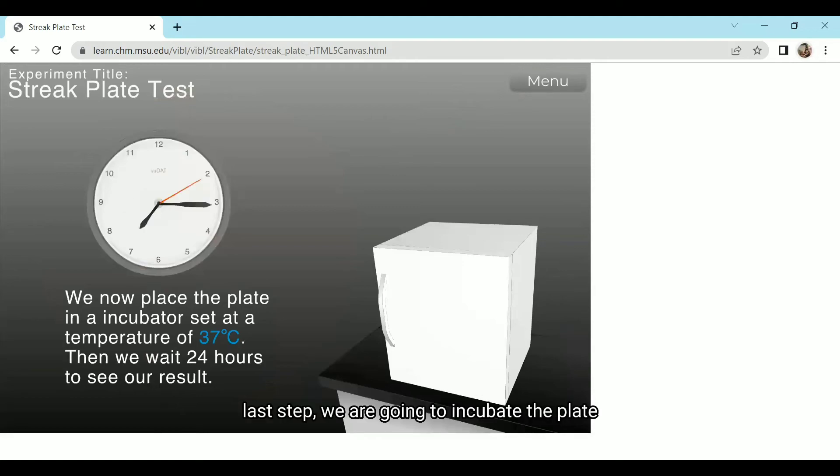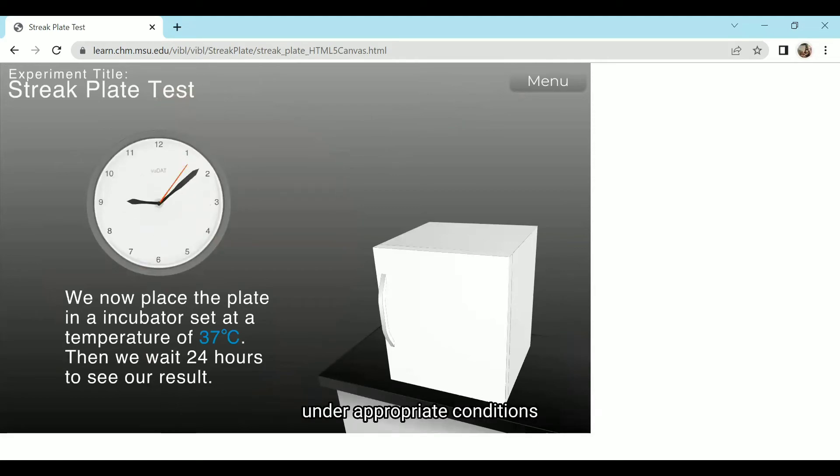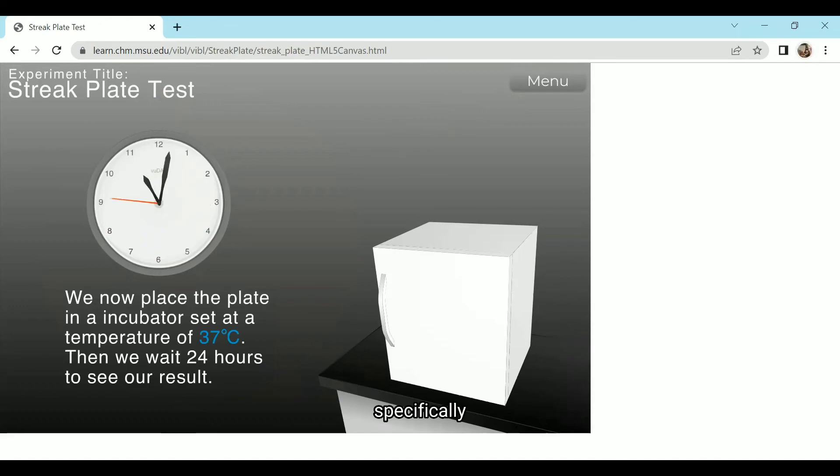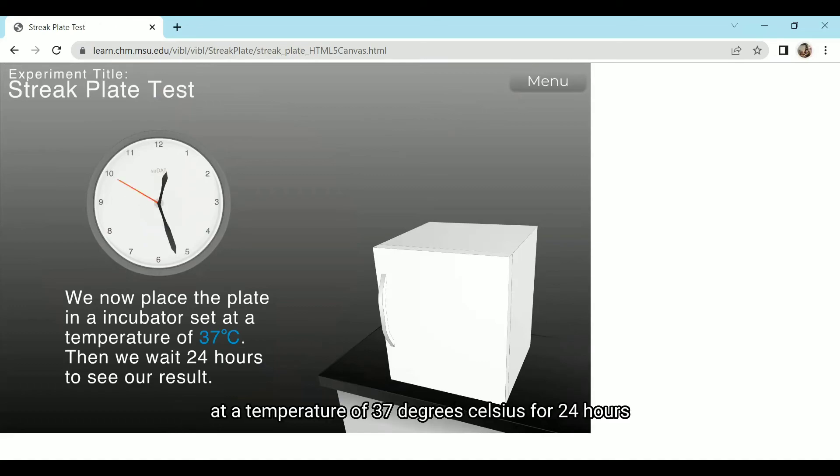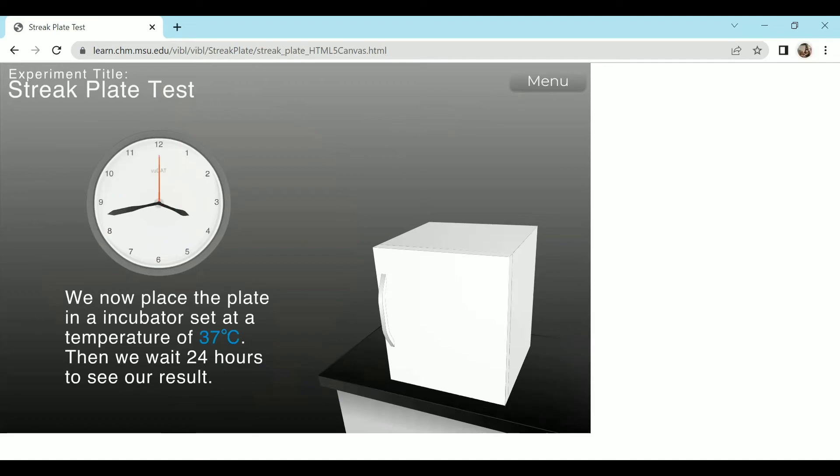Last step, we are going to incubate the plate under appropriate conditions, specifically at a temperature of 37 degrees Celsius for 24 hours.